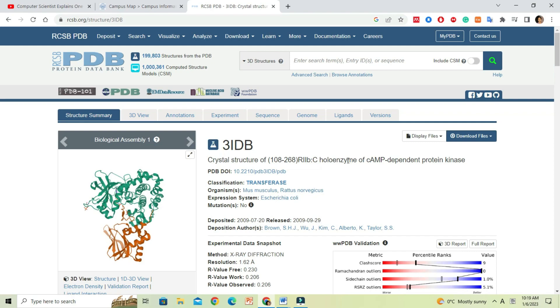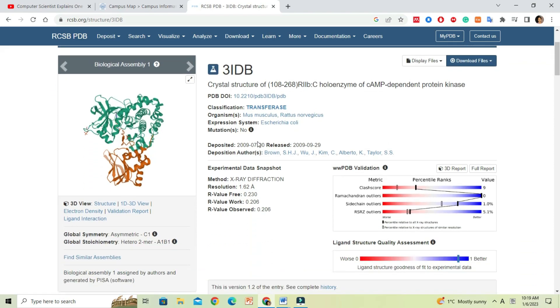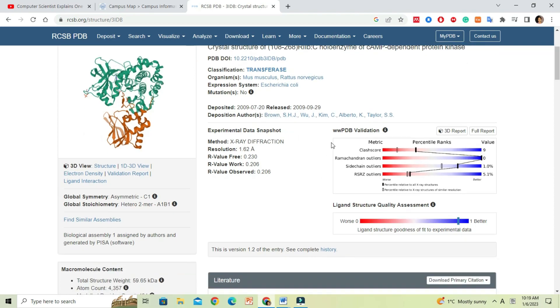For this tutorial, I will use protein ID 3idb, which represents a crystal structure of RIIb:C holoenzyme, the cAMP dependent protein kinase.